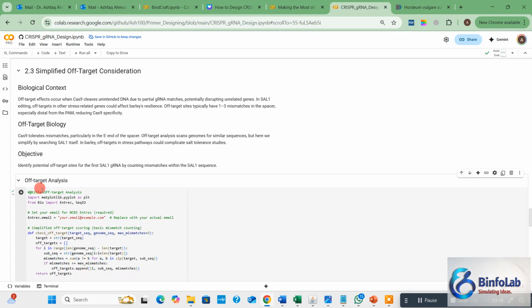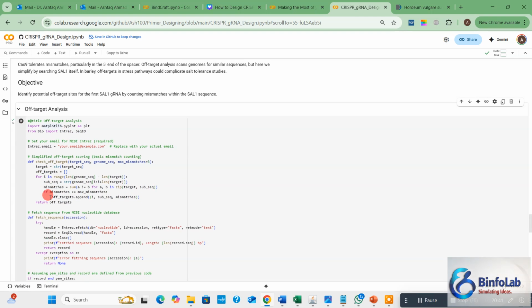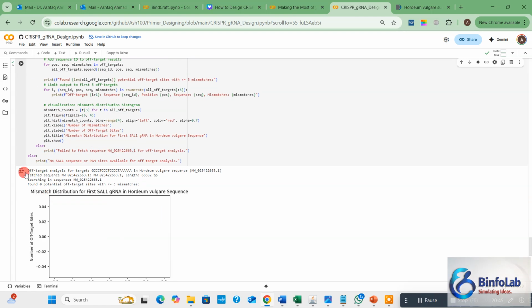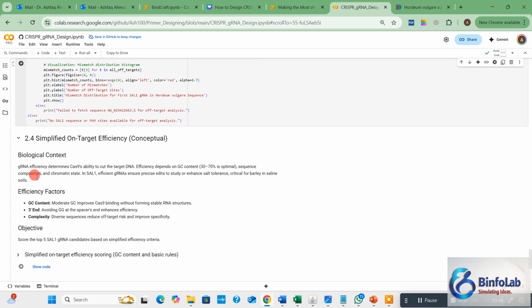But if you are seeing some off-target hits here, that is not a good result. You should consider your second, third, or fourth gRNA. Okay, so let me clear it now.